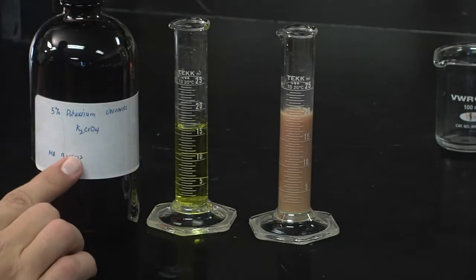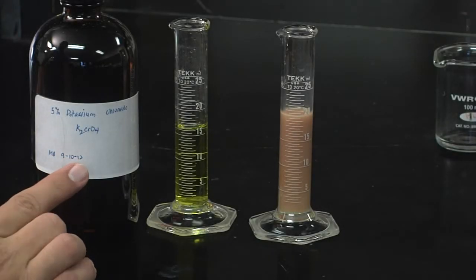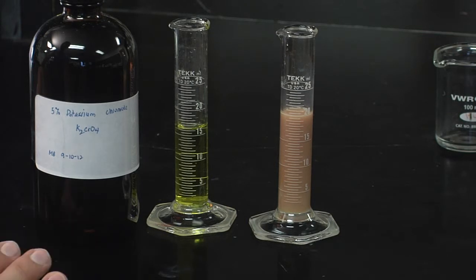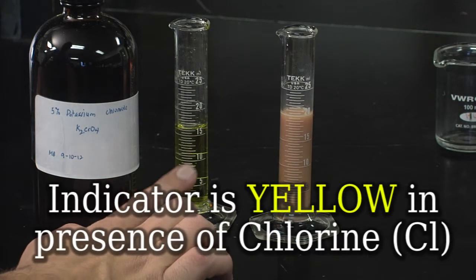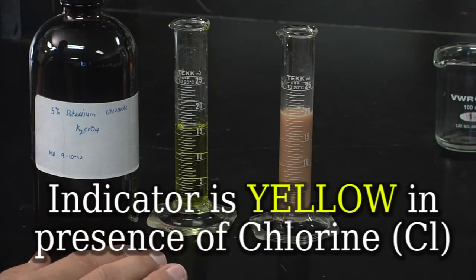We will be using potassium chromate indicator, which measures the concentration of chlorine ions to help us determine our endpoint. Potassium chromate indicator turns yellow in the presence of chlorine.